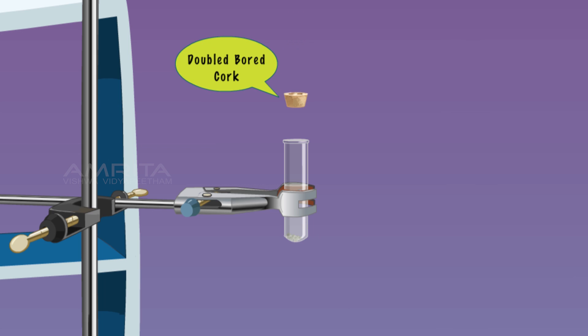Cork the boiling tube with a double-bored cork. Insert a thermometer through one bore of the cork. Keep the bulb of the thermometer about 3-5 cm from the surface of the water.